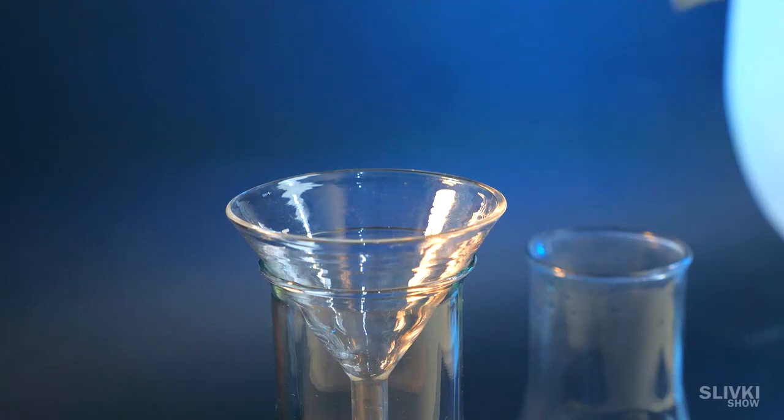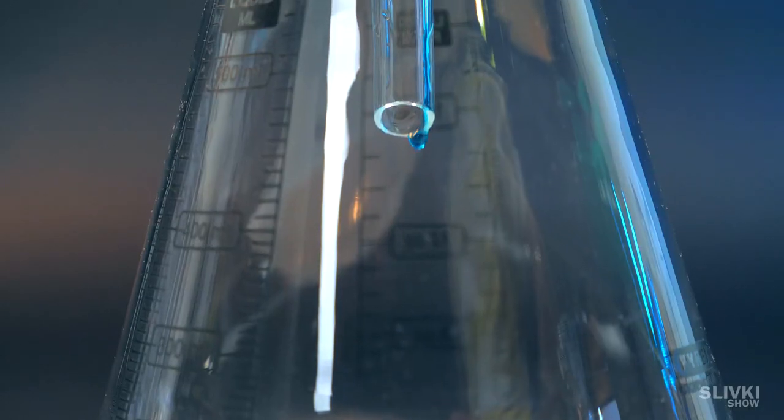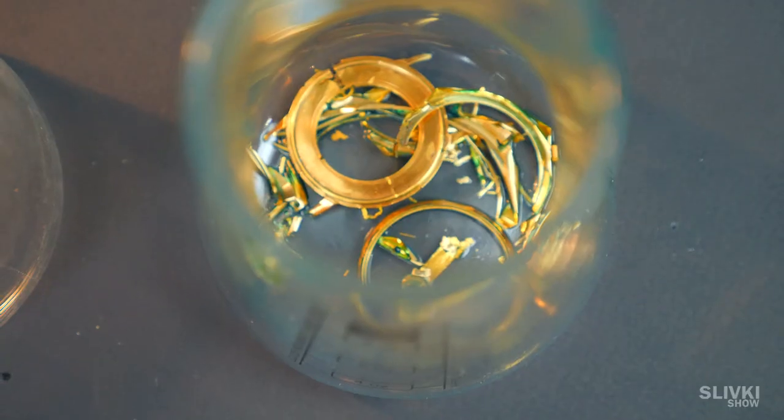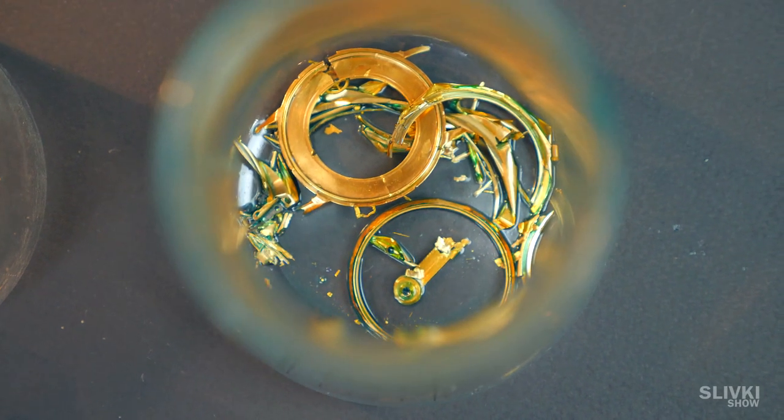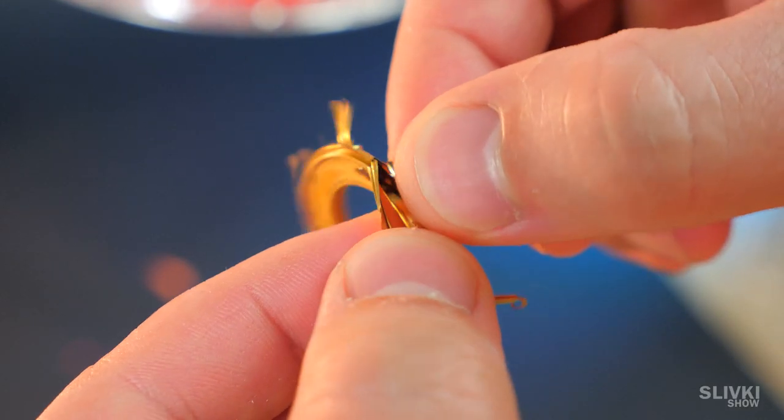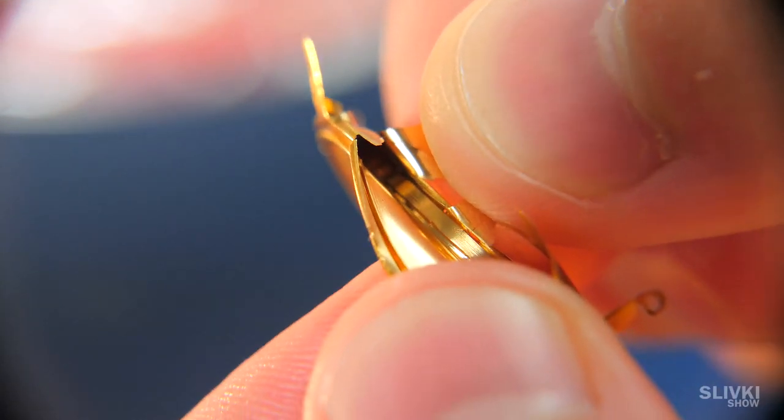Now we get out the flask with a funnel and pour our substance through a filter, so by chance any particles of gold left there. Gold that's left on the bottom we need to rinse with water and carefully clean from acid. Pay attention that acid destroyed only the inner part of the casing, which was from different metal, leaving only the gold shell.